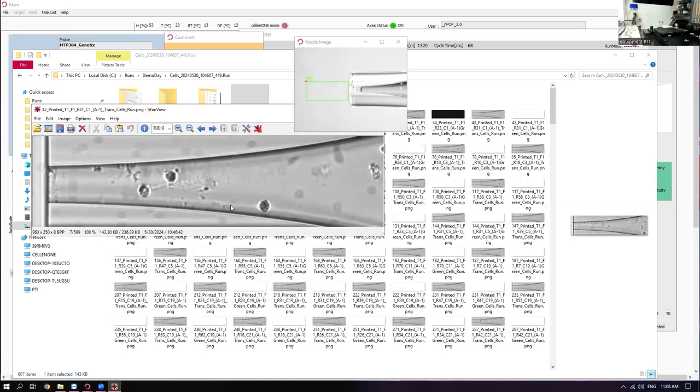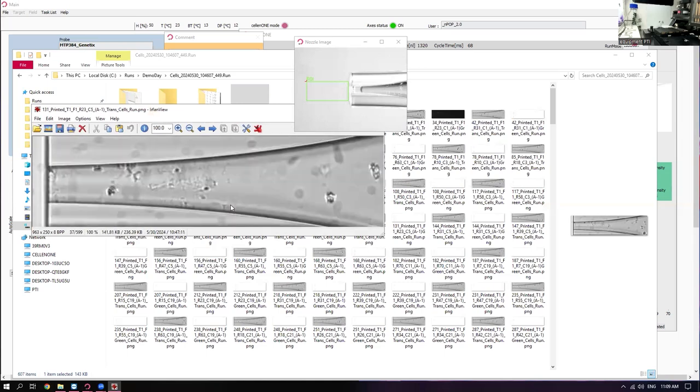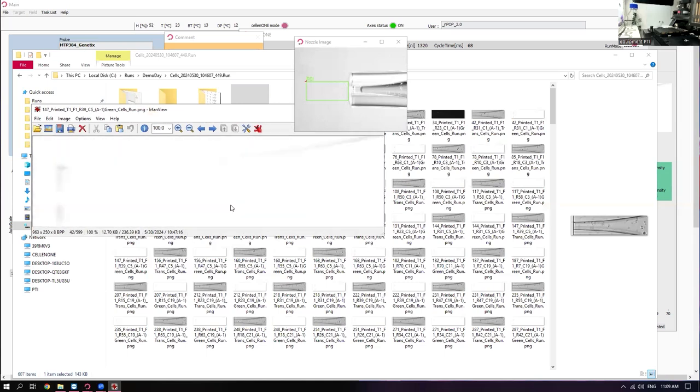Right. So you get images of all of your cells here, both fluorescent and non-fluorescent. You can see some of these are pretty junky cells, but you would be able to go through here and essentially correlate back and QC yourself on what these are. And Andrew will show you later, in his analysis package, you look at correlating diameters to cells. You can see cells that are sitting outside of this kind of normal range, and it seems pretty clear that something's weird there.